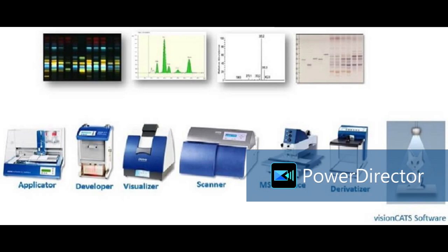I tried to explain in a shorter way, but within a few days, if you have the system in your hand, you will learn this after running 2-3 plates immediately. You only have to handle the plate from one module to another module and place it in exactly the position. The rest of the system is automatic, if you have the ATS4, scanner, visualizer and TLC chamber, nothing else.